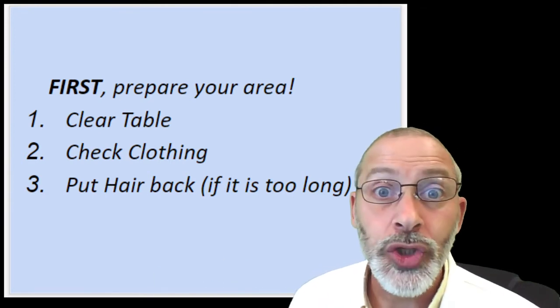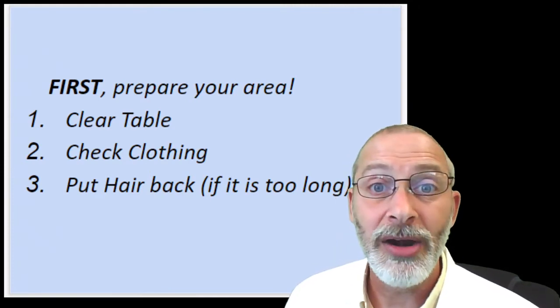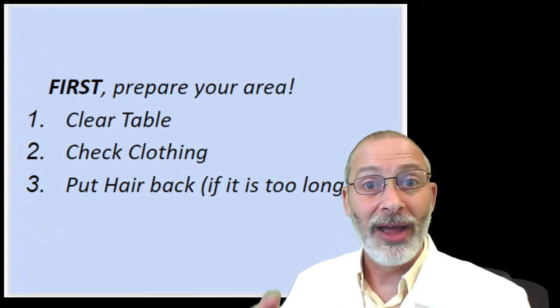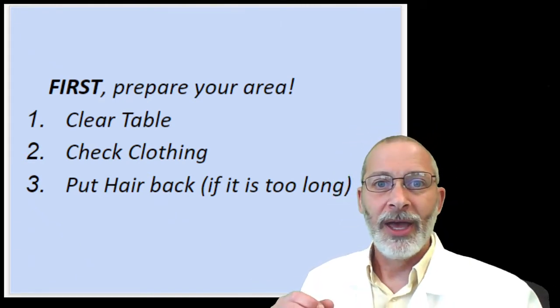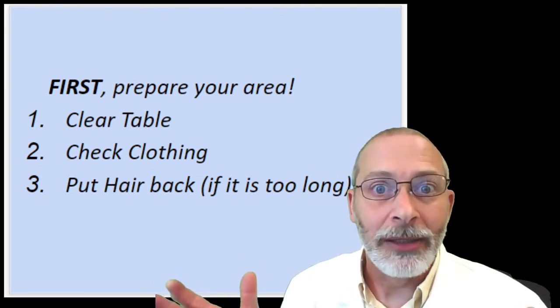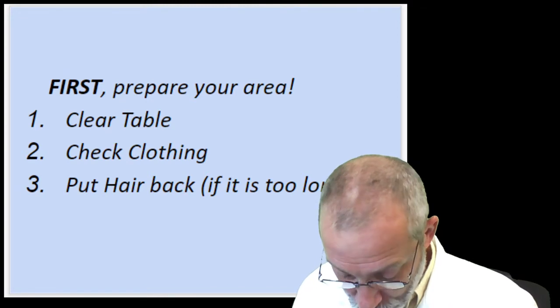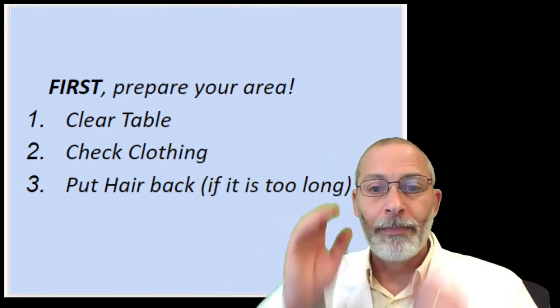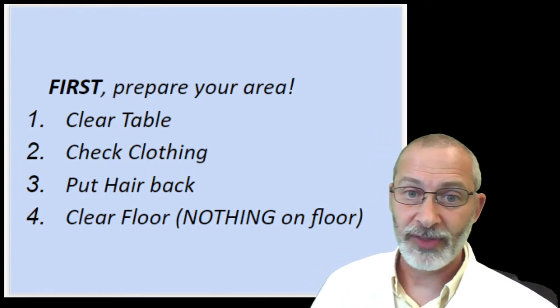Now, what is too long? Well, if you put your head down and you can see your hair, it's too long. Now, again, it's not too long from a point of view of style, it's too long for the lab. So if you put your head down, you can see your hair, tie your hair back, all right, for your safety and the safety of everything else.